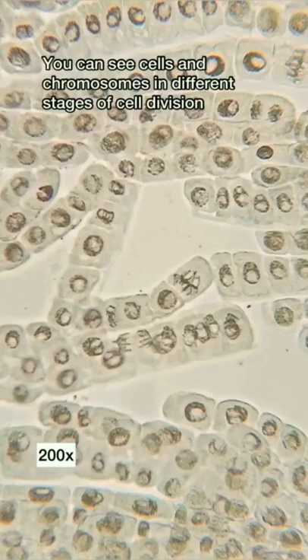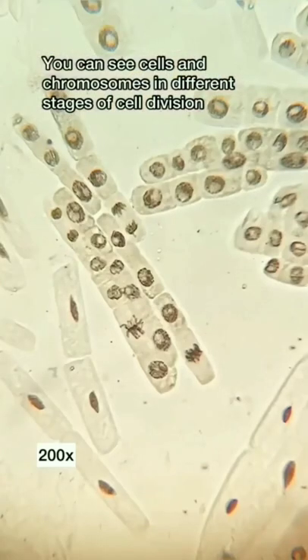Now, view it under the microscope. You can see cells and chromosomes in different stages of cell division.